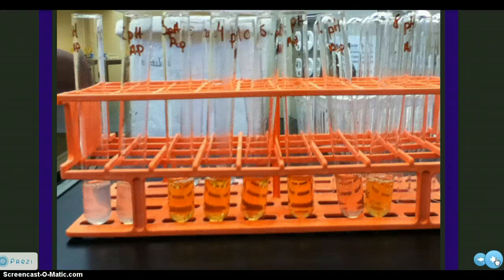pH 12 had a slighter reaction. We labeled that a 2. And our pH 8 is very light. So again, we labeled that as a 2 going to a 3, but we stuck with 2 because it didn't have such a striking color as the others.